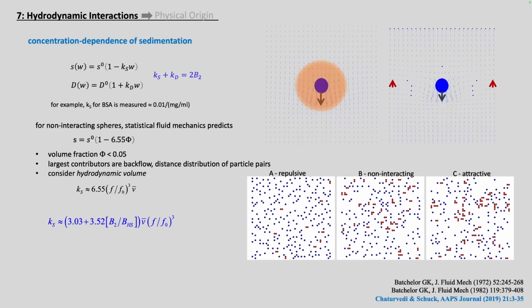in my mind. If there are attractive interactions where the virial coefficient is smaller, then they will be more likely to be close by and have hydrodynamic interactions, like in this case. Vice versa, if there are repulsive interactions, then they will on average keep greater distance so that non-ideality becomes larger. Taken together, this provides the link between the Ks values, frictional coefficients and virial coefficients, which we have tested and found useful, for example in the study of formulation conditions of therapeutic proteins. Essentially, this is a way to measure interactions even if they just modulate the probability that molecules are close by in solution, and even in repulsive cases.